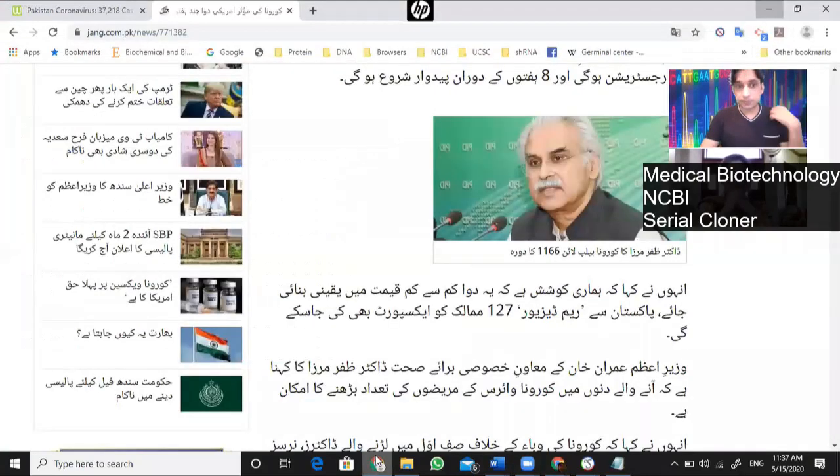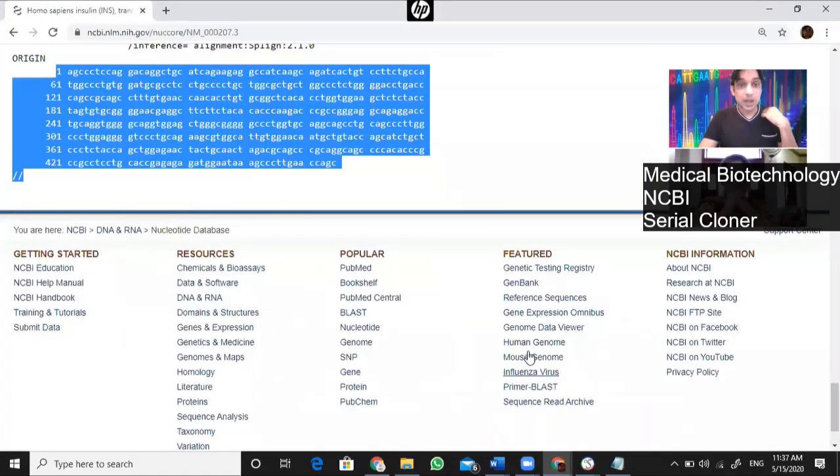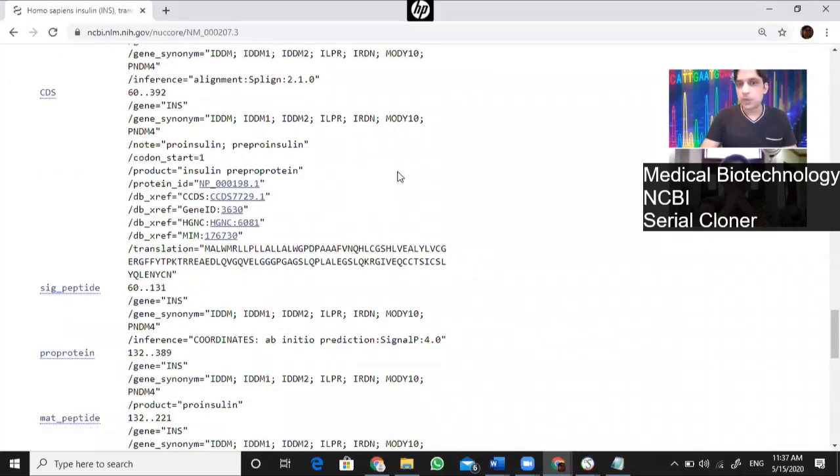For example, last time I asked you about the consensus CDNA sequence, and I told you that the NCBI has a separate website for that thing. Do not wait somebody else to take you there. Please, please. Okay, एक बात पहले मान लें, कोई हमारी मदद नहीं करने वाला, कोई भी, मतलब कोई किसी की हेल्प नहीं करता. ये बहुत, I'm sorry to tell you this brutal truth.